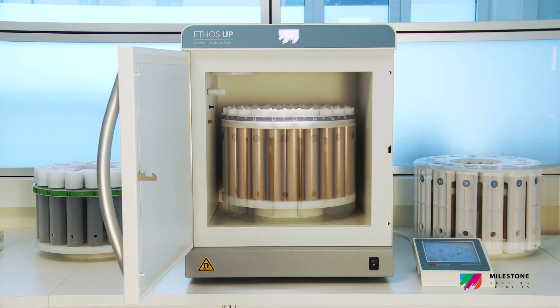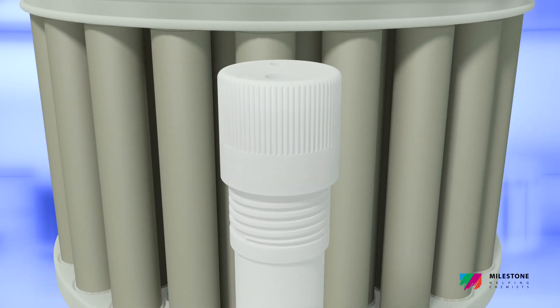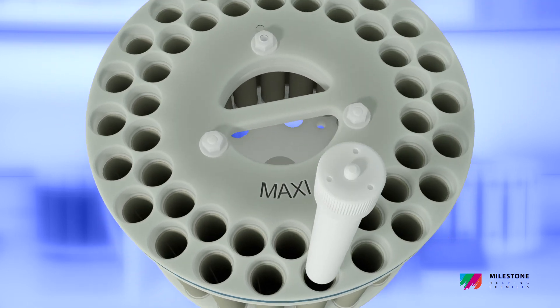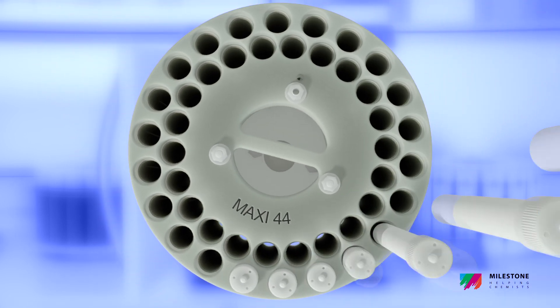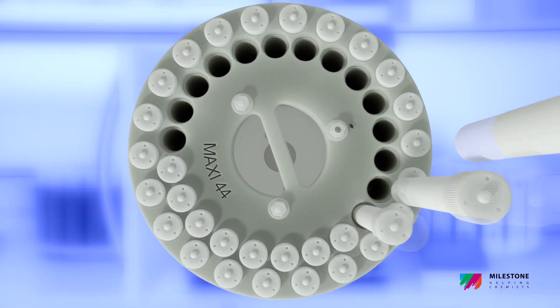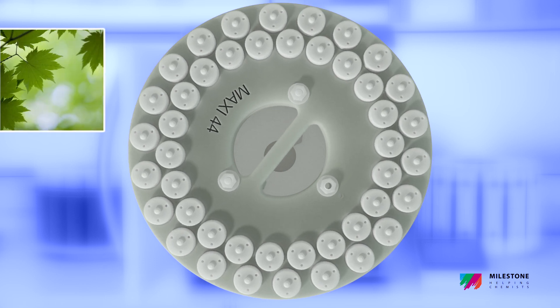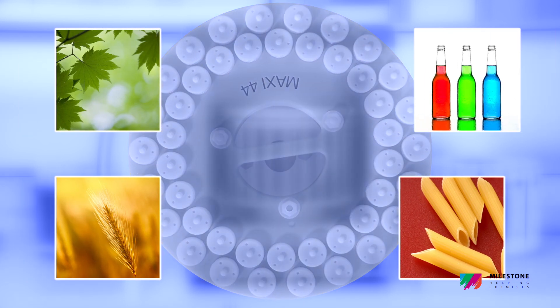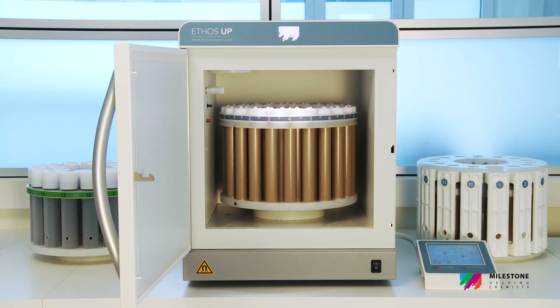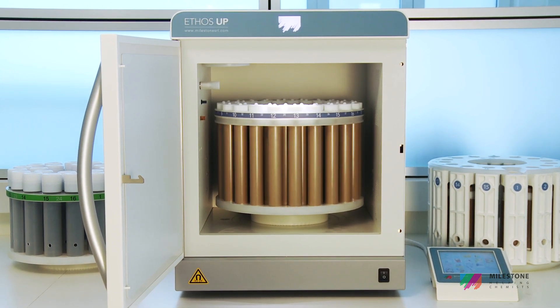The Maxi-44 perfectly matches the high productivity and quick turnaround time of many labs. It is a high-throughput rotor featuring up to 44 PTFE vessels suitable for routine applications and batch samples such as environmental, agriculture, food and feed matrices. The Maxi-44 combines an unmatchable ease of use with the highest sample throughput available on today's market.